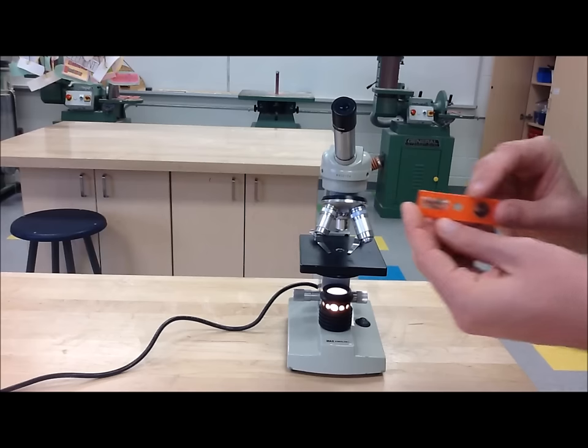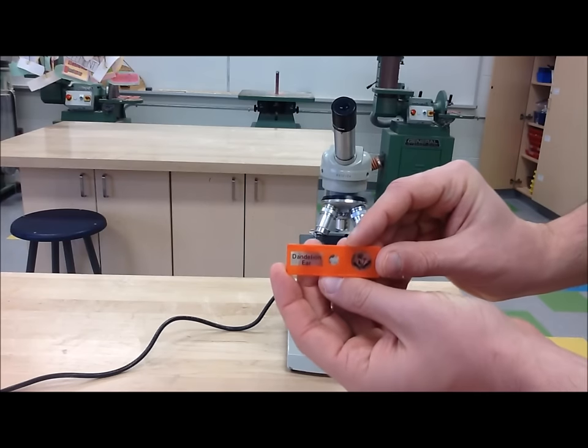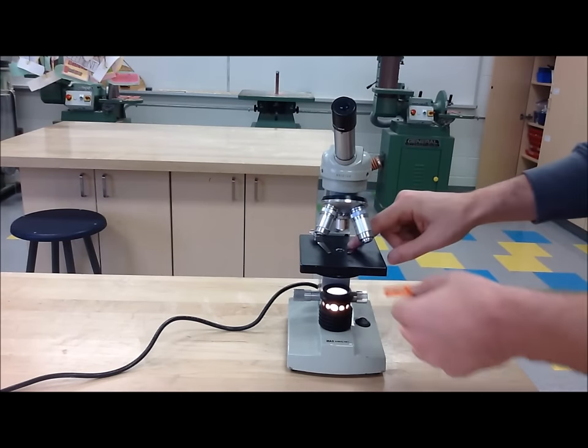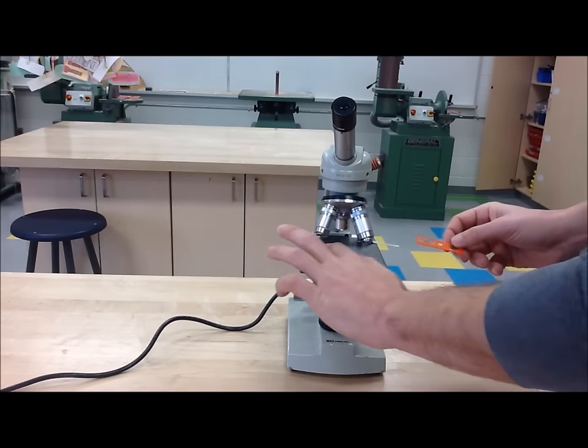Step 7: Place a properly prepared slide on the stage with the specimen directly on the light. Fasten the slide using the stage clips.